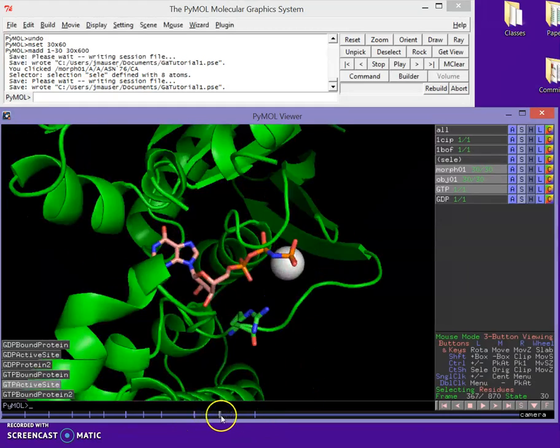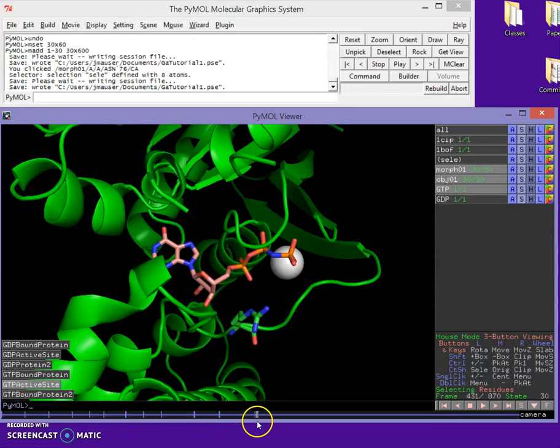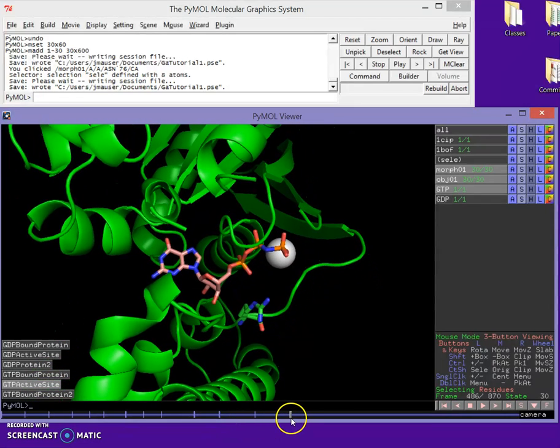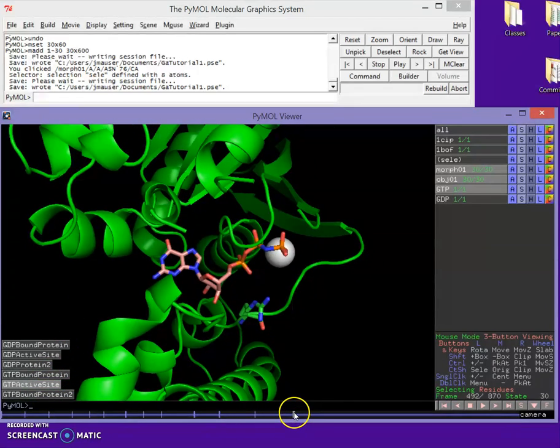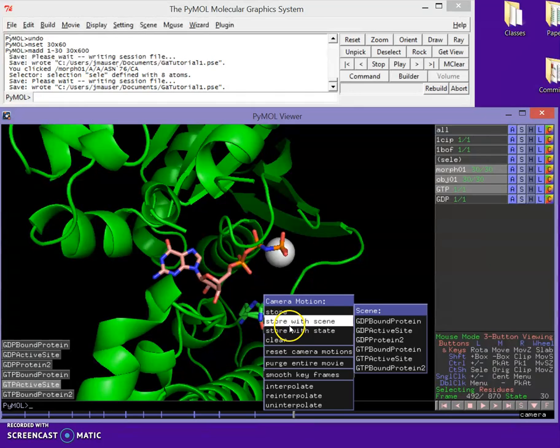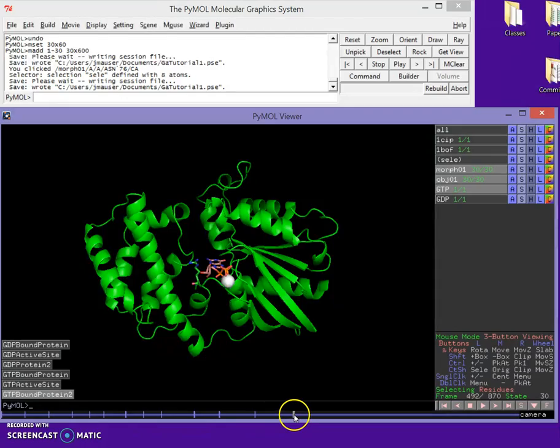Sounds good. So zoom in on the active site, let us look at it. And then I want to zoom back out to the whole protein, so I'm going to move out a little ways here. And I'm going to store with scene GTP bound protein. So that looks good.